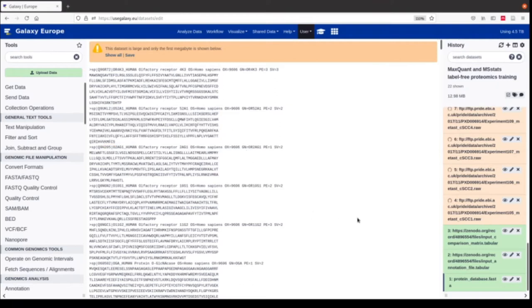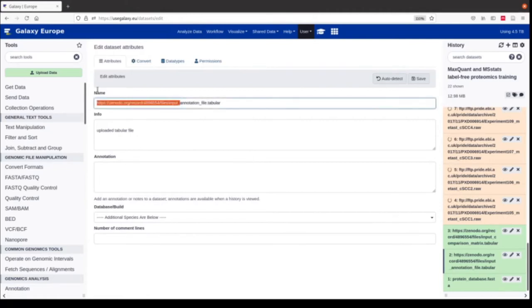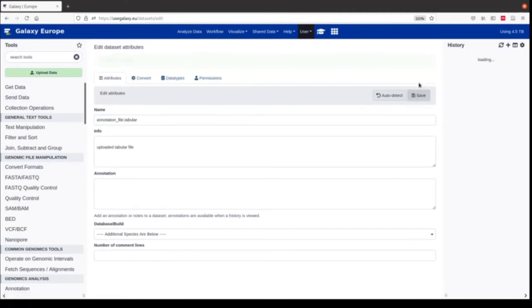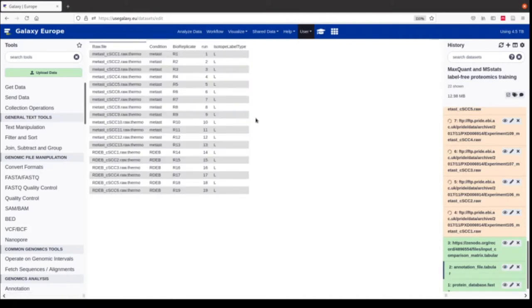This FASTA file we will use for MaxQuant, which does identification and quantification of proteins. Then we have an annotation file — I also remove the URL prefix here. This file is important for the MSStats analysis. It contains the experimental design setup of the experiment. This file always needs to have five columns when we use it with MaxQuant output. The first column contains the raw file name, and it's important that this name matches exactly the name of the raw files in the MaxQuant output.